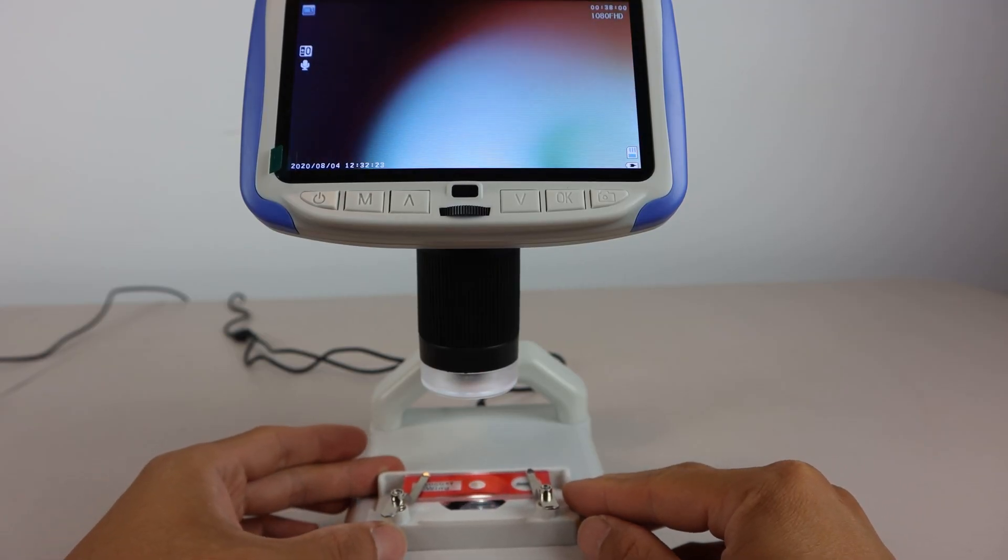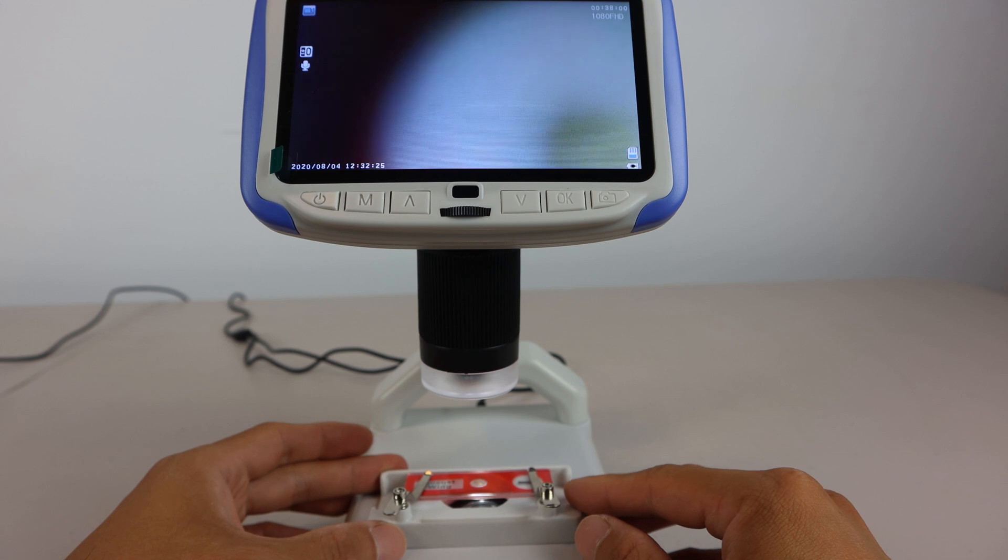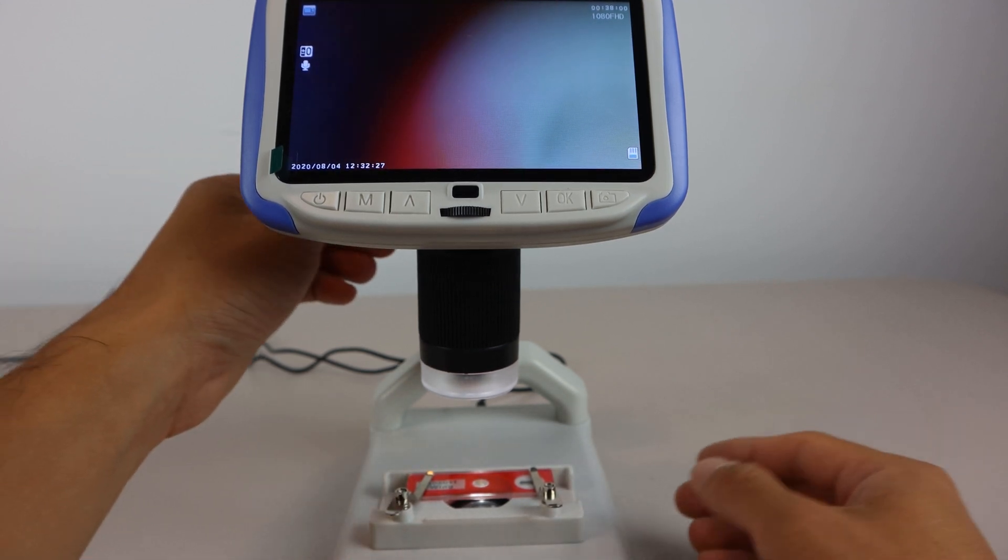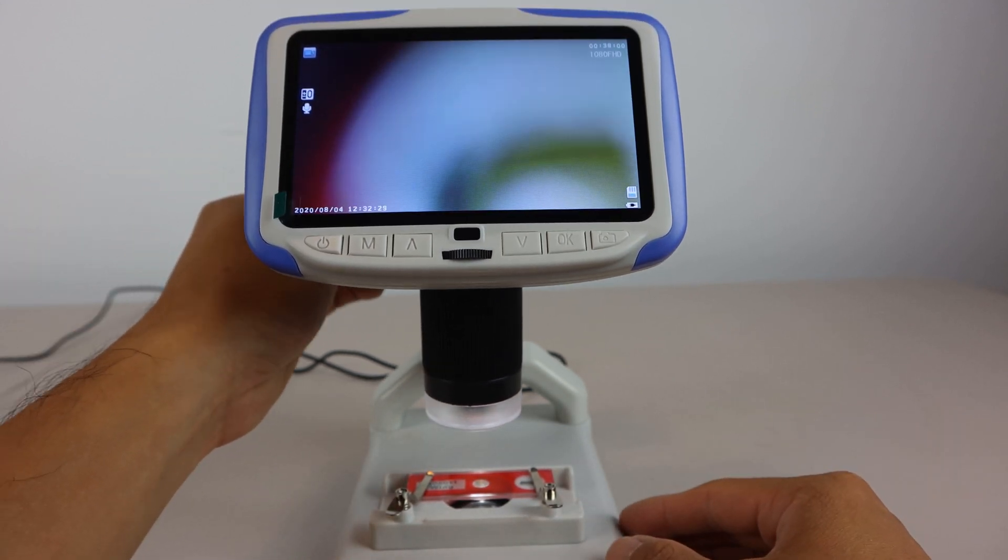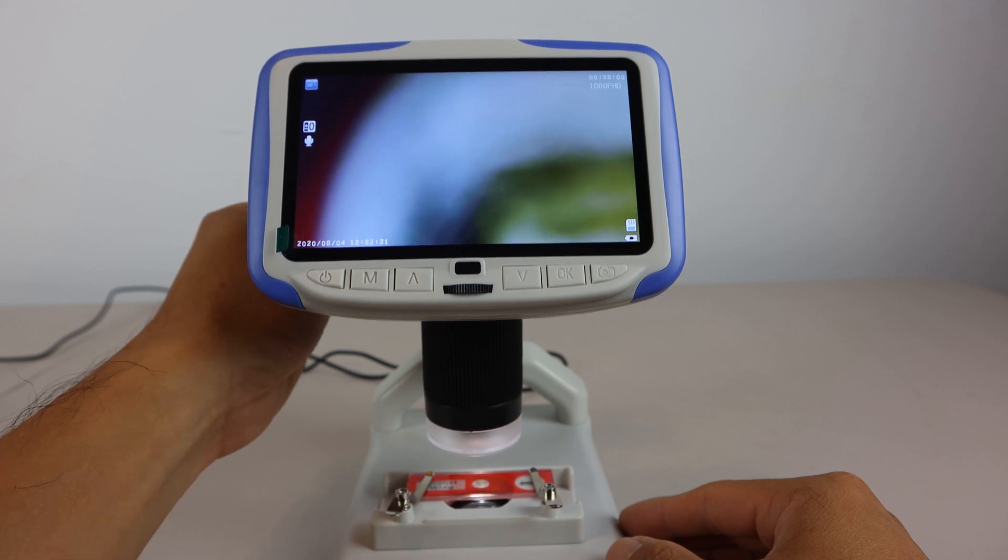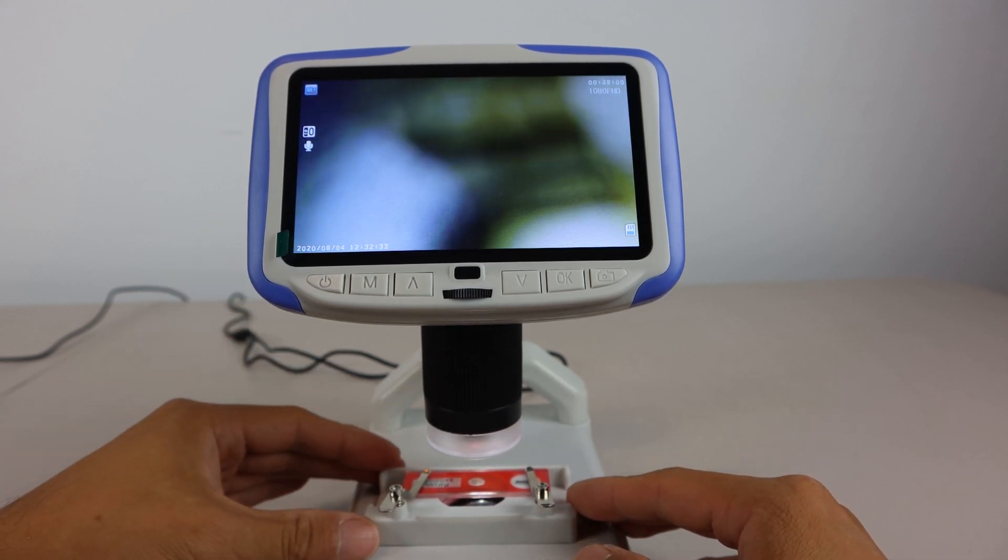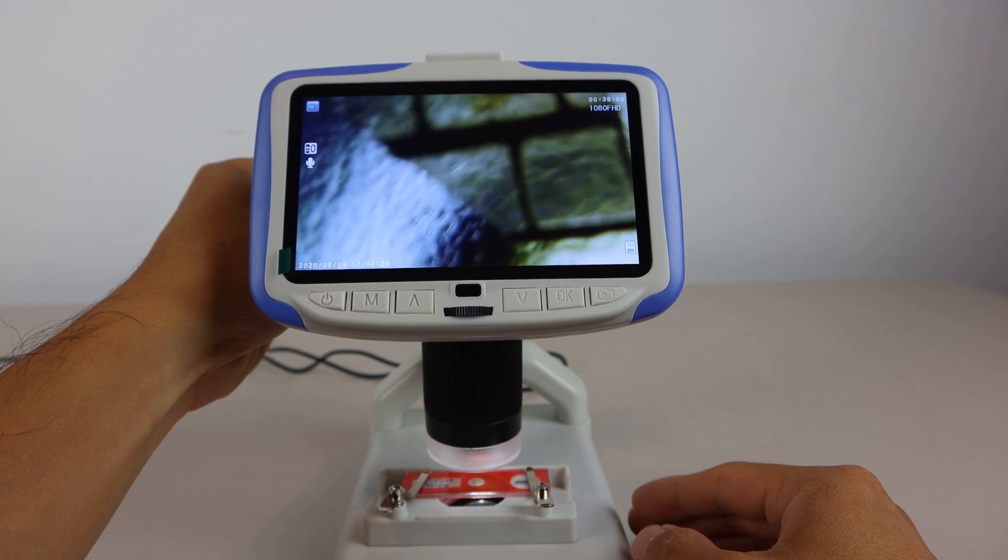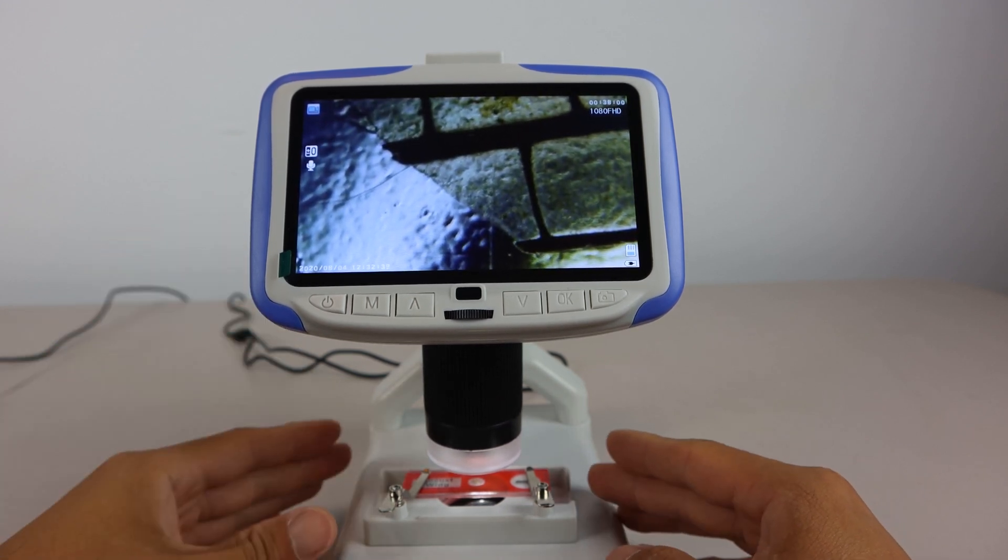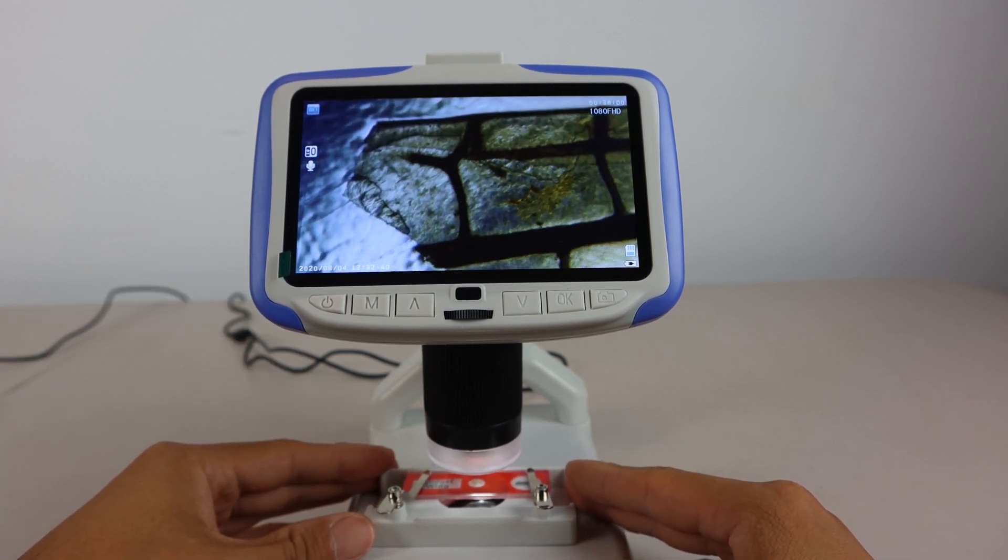Let's have a look at this locust wing. After placing the slide and block under the lens, we'll adjust the height of the lens lower with the blue knob until the image is in focus. The magnification is about 200 times, and that looks pretty good. Now we can move the slide around to find the sample.